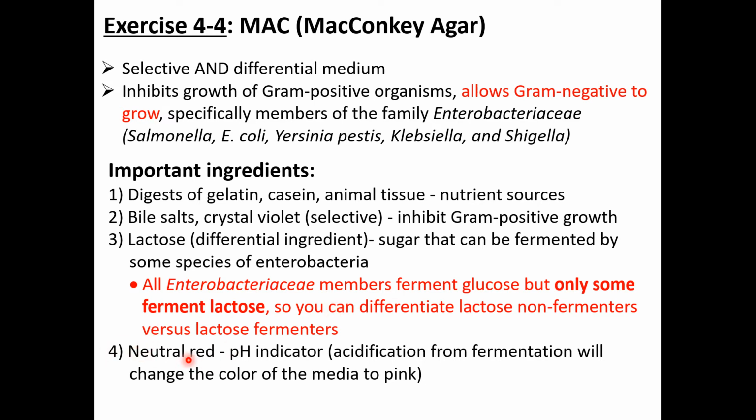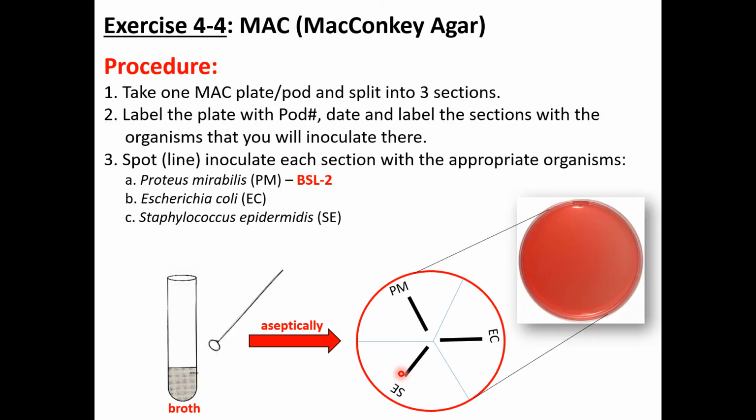So this plate would also be red, not because of phenol red, not because of blood, but because of neutral red. Neutral red is another pH indicator. It's also red at neutral pH, but if there is fermentation of that sugar, in this case lactose, neutral red will turn pink. So the medium where you see the growth of the bacteria, if there's fermentation of the sugar, we would see the medium turning pink. Pink is very different from red. We could definitely tell the difference.